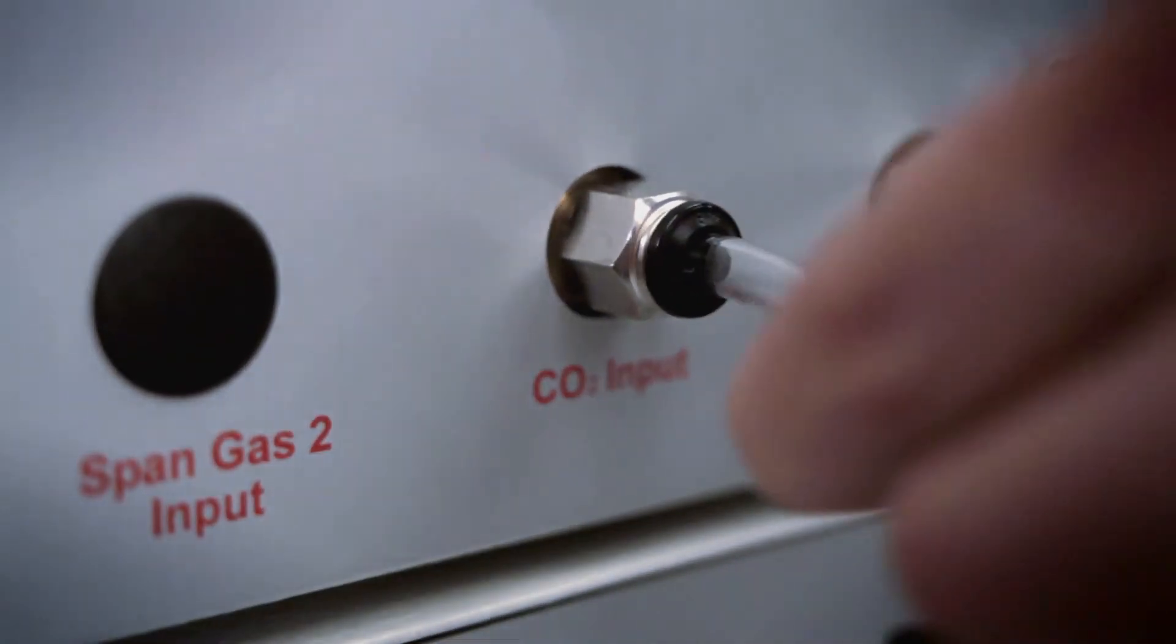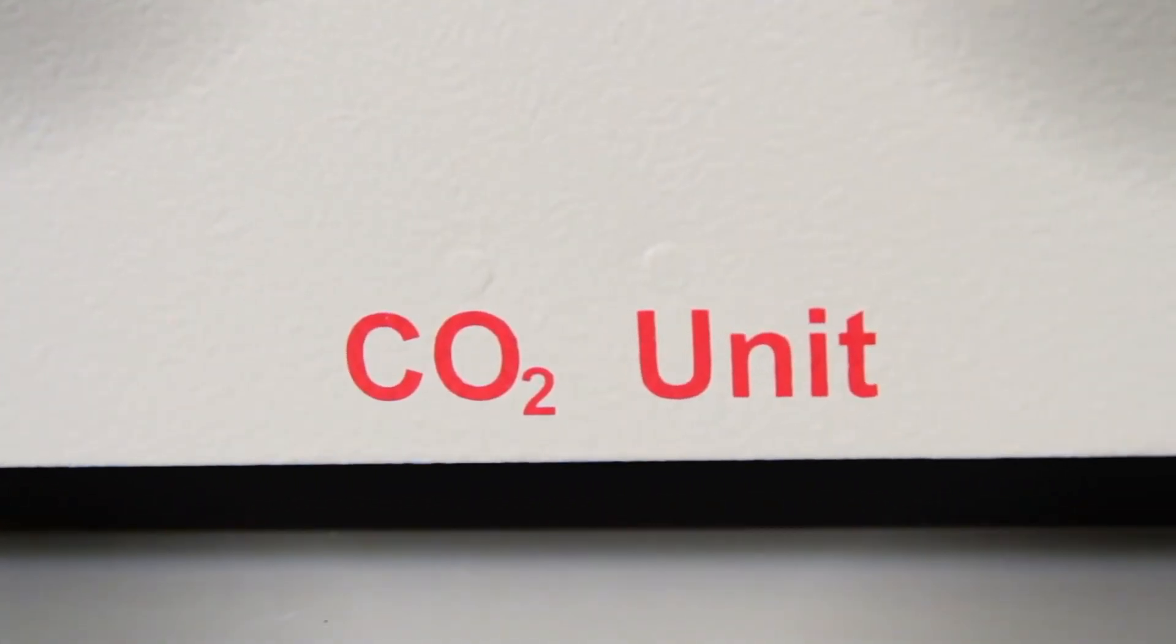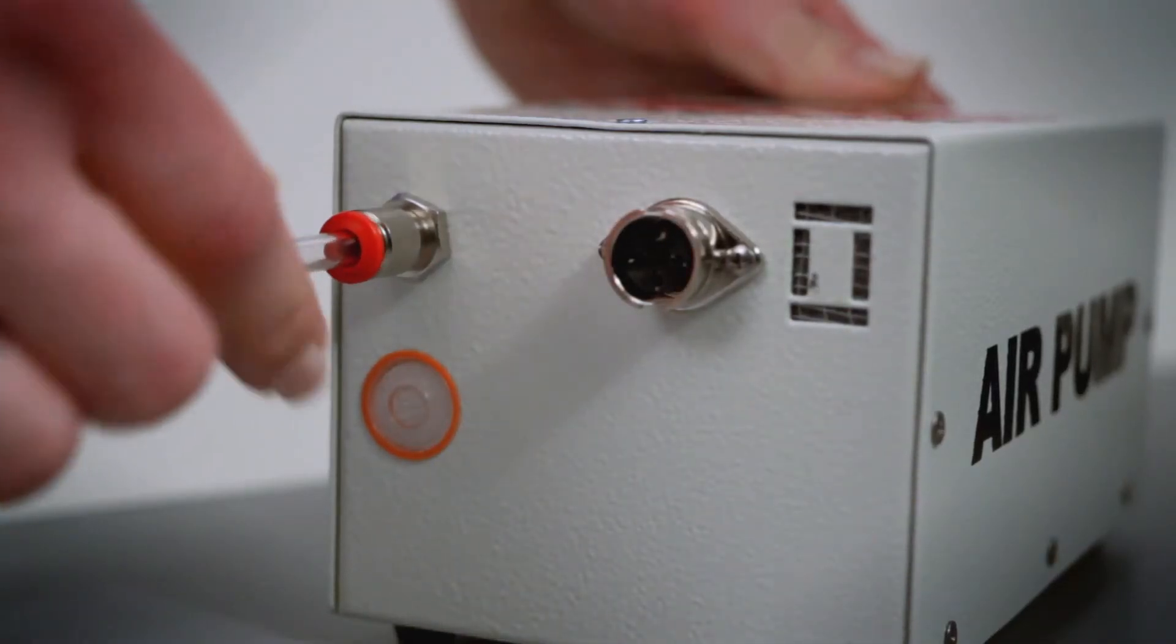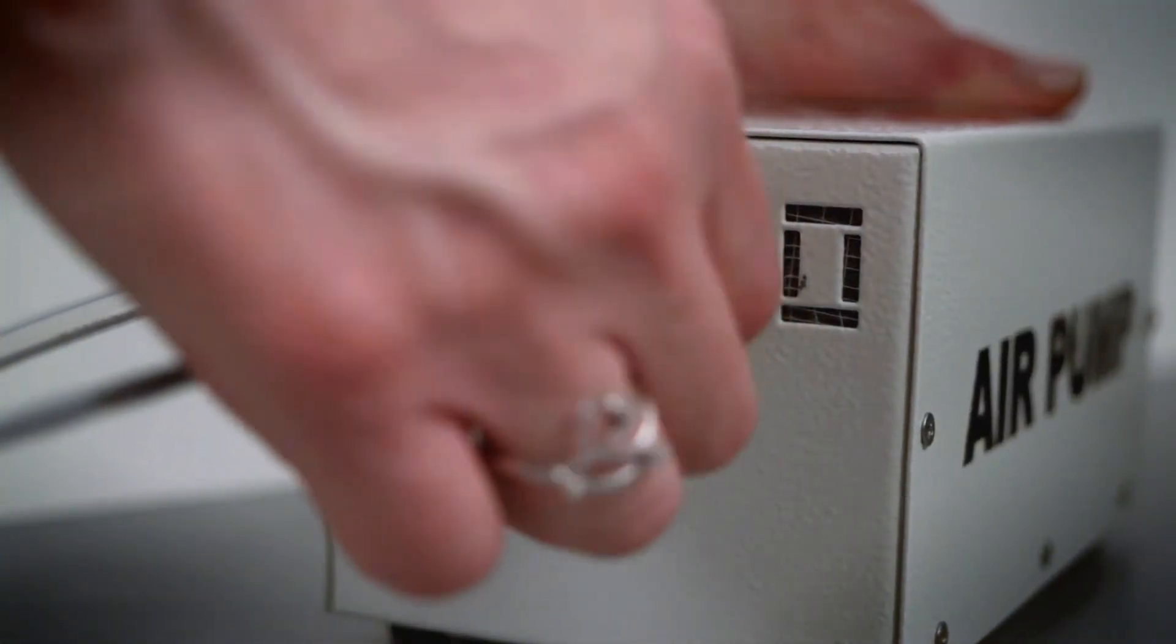Pure carbon dioxide and compressed air are needed to feed the CO2 unit. The Oco air pump can be conveniently used if compressed air is not available.